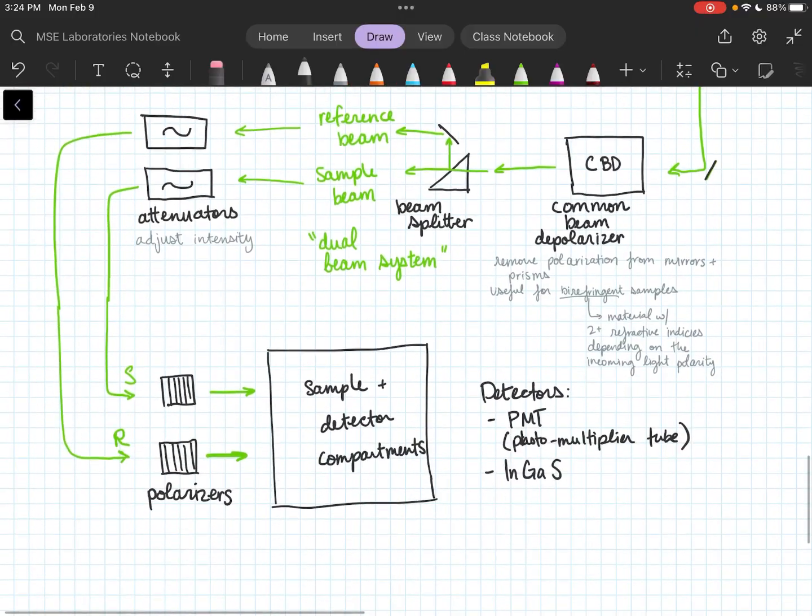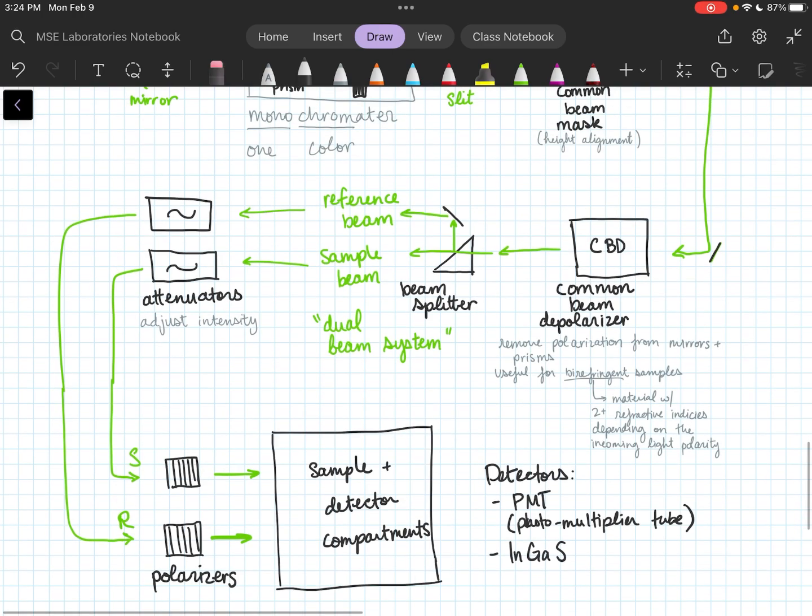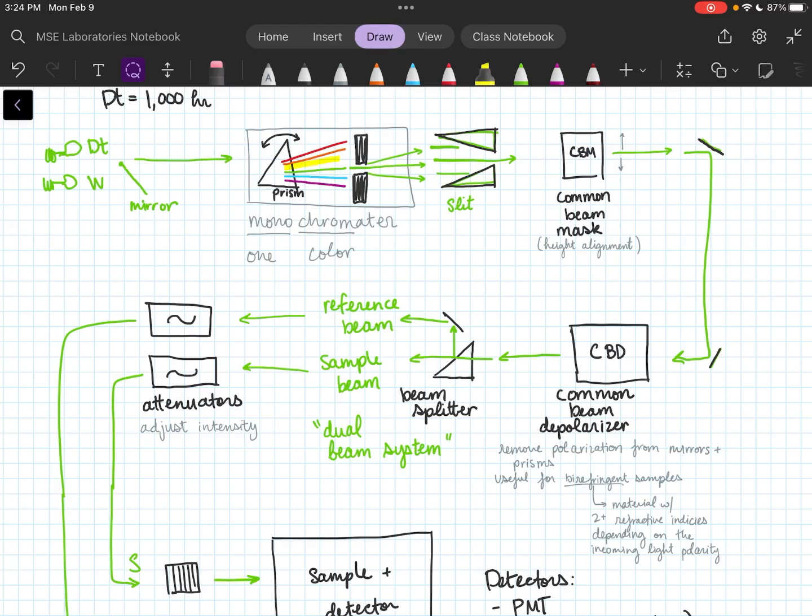Do you have questions about the lamps or the setup of the instrument? What is the most common beam used? Like when you run a test, do you use them all? Usually. Use what all? Like all of these different attachments and things. So our instrument in the materials characterization lab right now in 2026 has all of these. Our instrument is a little bit older, so some of these have probably been improved over the years. We have all of these.